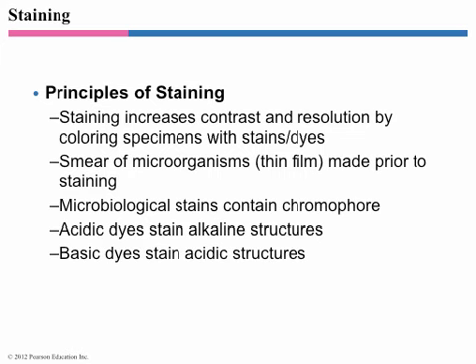If you're looking at a tissue sample, and even as microbiologists we may be looking at a tissue sample because there are some microbes that can't be cultured in the lab and you have to actually look at them inside, if you're a forensic microbiologist or something and you're looking at bacteria that are living inside of someone, you would usually embed a piece of the tissue in wax, in paraffin, and make very thin slices of the wax, and then that's what you would look at.